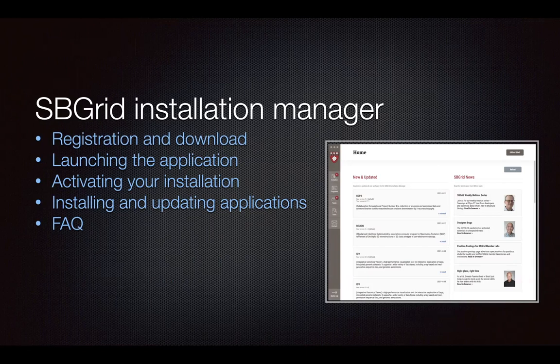The new graphical version has not been formally released, though I've shared some beta versions with users, and we're this close to releasing it. So this will be a great chance to show it off and walk you through how it works. And we can discuss, take some questions, and see where it goes from there.